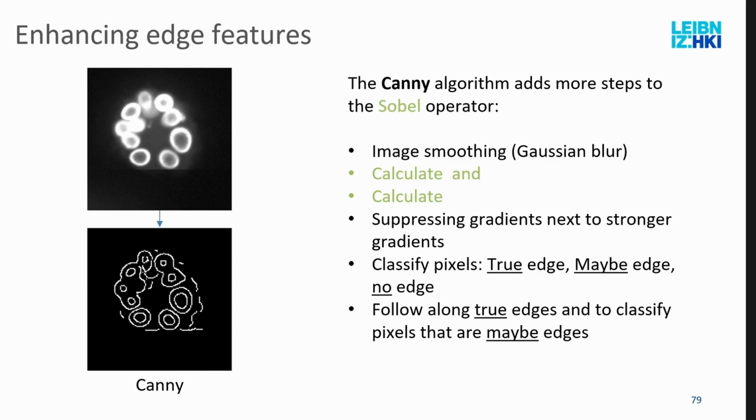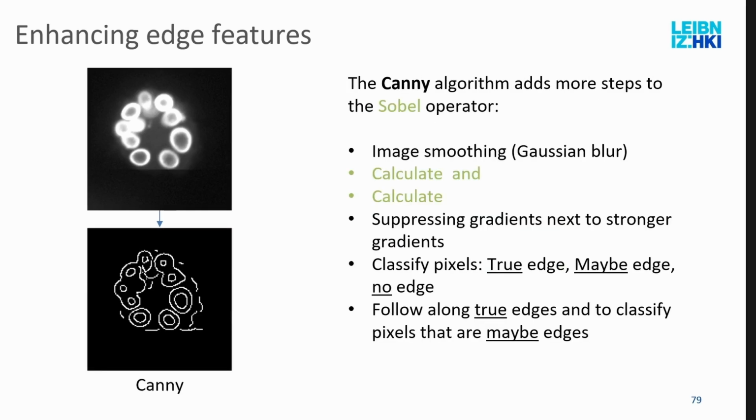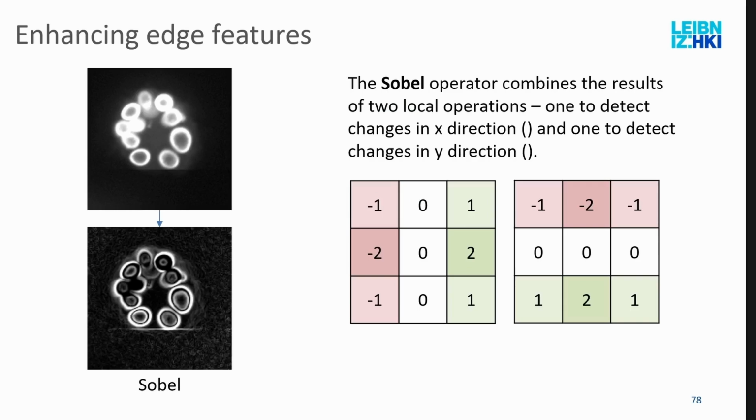And then my formulas are gone again. What it basically will do, it will calculate the Sobel in X direction and the Sobel in Y direction, both. And then the formula for gradient is missing. It basically combines the outputs of these 2 together to make a weighted average, or an unweighted average. So there's 2 different operations, one that uses a square root and one that just takes an average of it. The square root is a bit more precise.